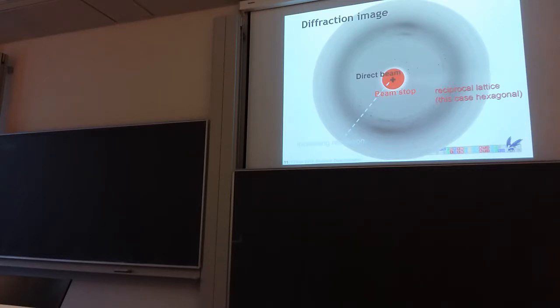So an experienced crystallographer, when he sees the first diffraction image coming out of the experiment, can immediately see whether it's going to be 8 angstroms, so basically useless, or 3 angstroms, which is cool, or 1 angstrom, which is really very good. Because they know that this spot there, that's 2 angstroms. So pretty okay.